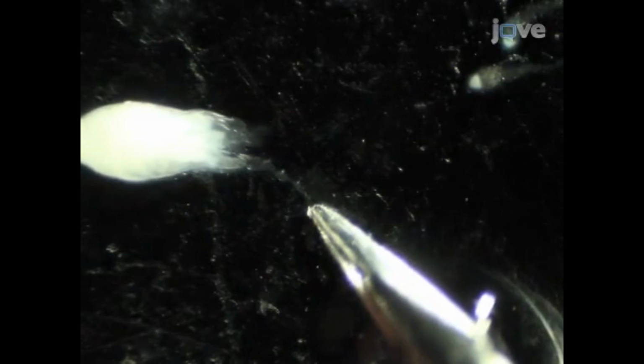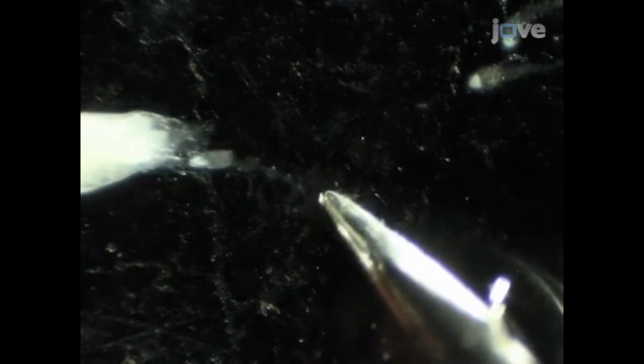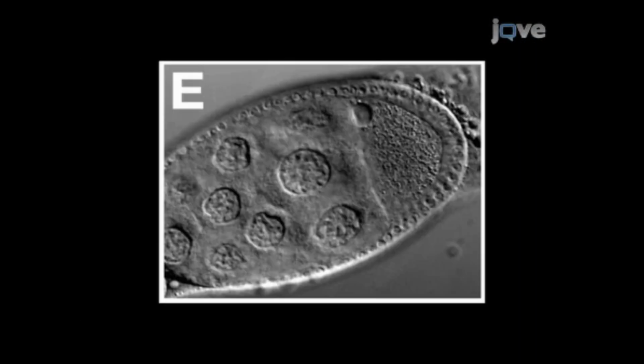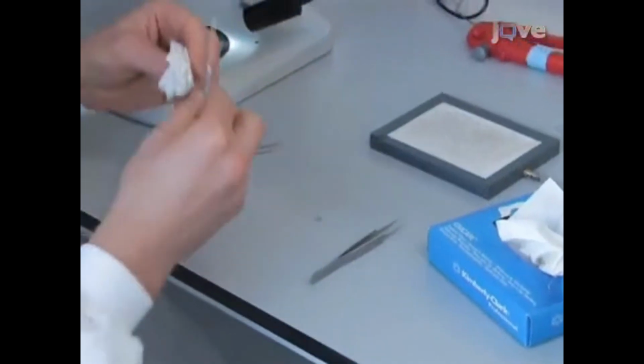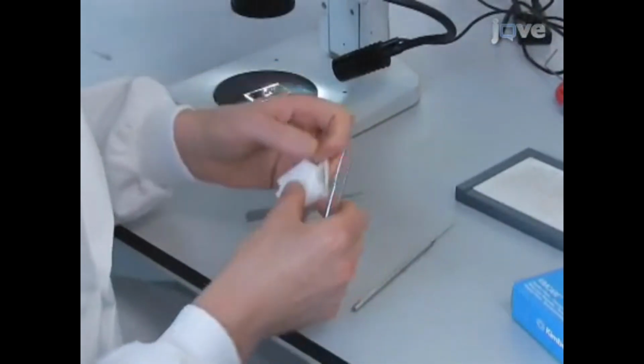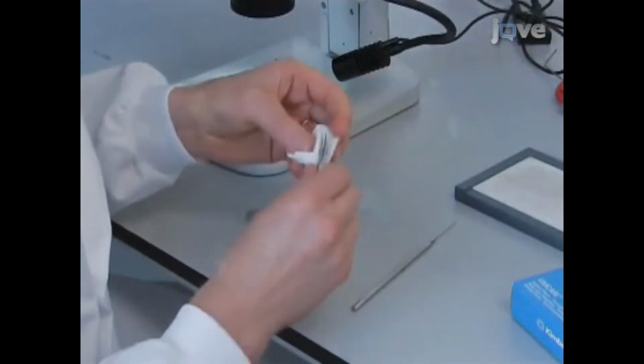With the probe, carefully drag 15 to 25 separated ovarioles to the center of the oil drop. If more than one ovary needs to be dissected, choose one from a different fly. Discard any excess ovarian tissue and work quickly, as oocytes will begin to display phenotypic changes due to stress after 40 minutes of being dissected from the ovary. Remove the excess ovarian tissue from the oil using clean instruments. For the injection of mid-stage oocytes, orient the ovarioles perpendicularly to the long axis of the cover slip.